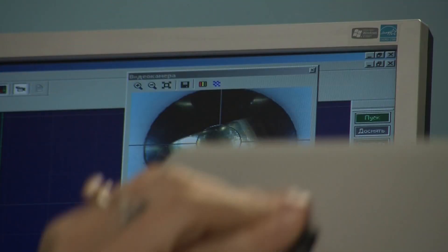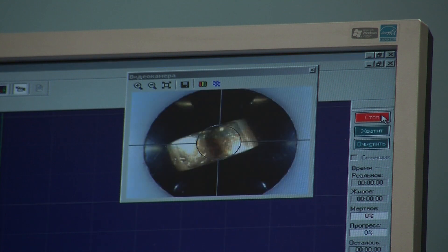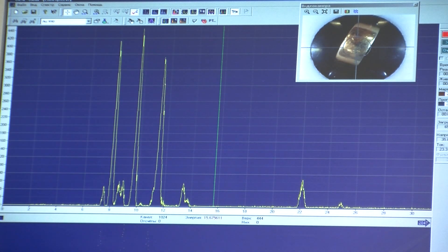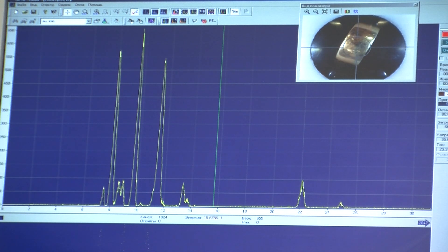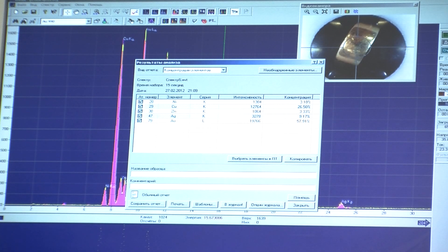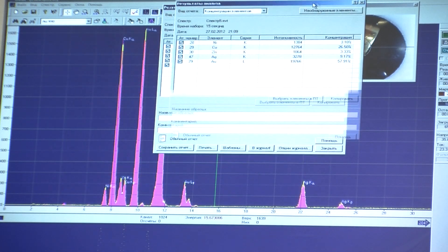After the first seconds of measurement, provisional results are shown, which are refined through to the end of the measurement. The elemental chemistry of a sample is determined in a matter of minutes or even seconds and is available on the spectrum diagram for further in-depth study if necessary. The Elva X-Mini combines simplicity with a set of most advanced analytical tools and features.